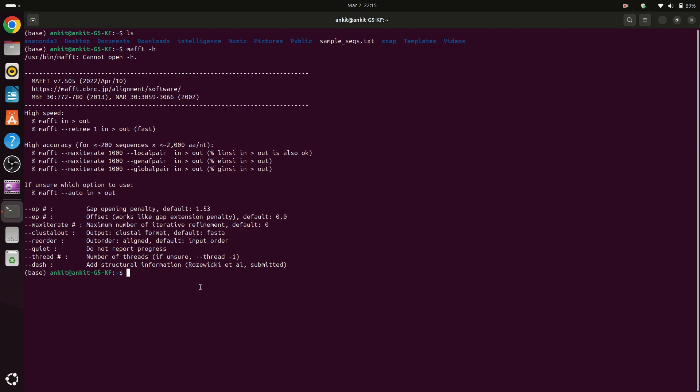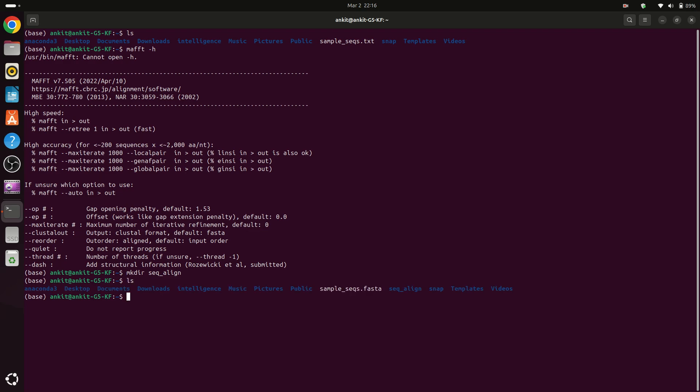So to run MAFFT we can first create a folder, for example sequence_alignment. So mkdir for making directory. Then we can see that we have created this folder.